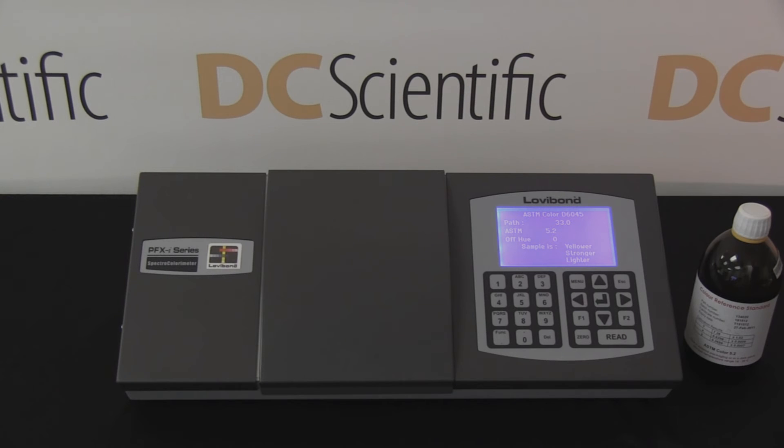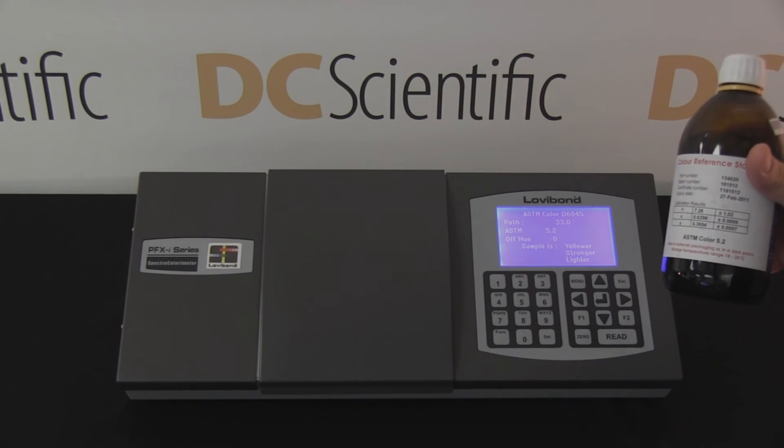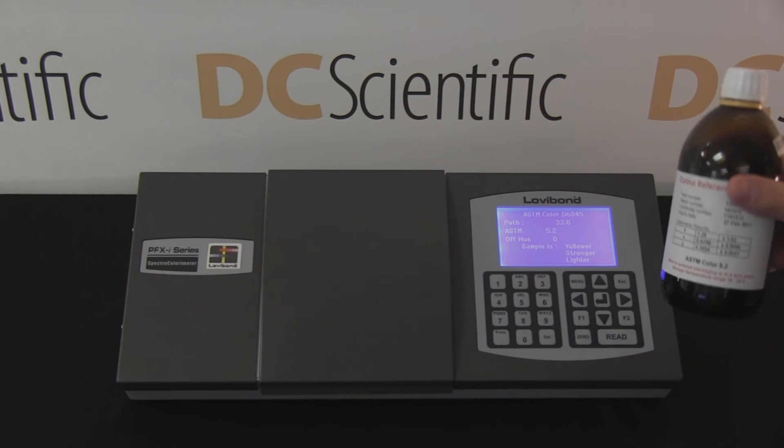The result — an ASTM color value of 5.2 — appears on the screen. The technician then checks the result against the ISO 17025 certified reference standard.